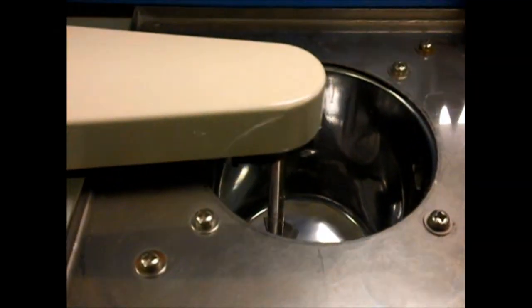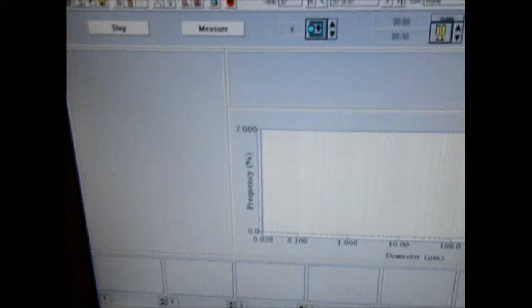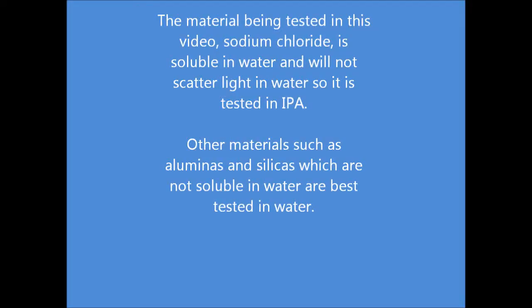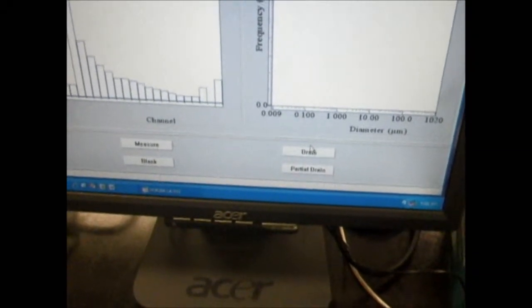To start a run, the first thing we want to do is clean out the analyzer. To do that, we need the circulation bath. I'm going to open a bottle of IPA and pour IPA into the cell. Then on the computer, I'm going to go to the Measurement button and select Drain. The only way to get liquid out of the circulation bath is through Drain, so I'll select Drain and the machine will drain the liquid through.